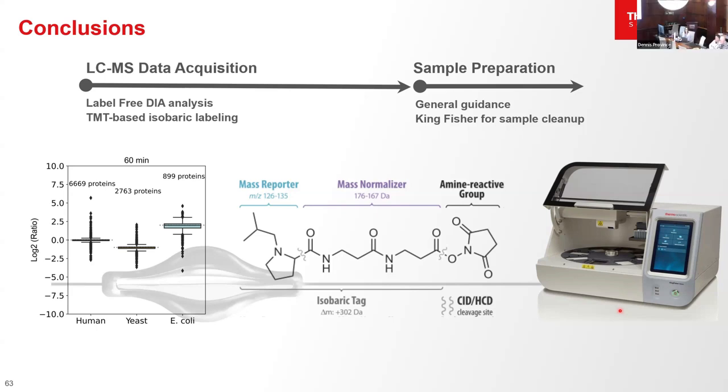That's good. So once we do biomarker discovery and find a biomarker, are we able to validate those with a regular assay, like ELISA, antibody-based? Yeah, so once you identify a biomarker, right, you want to validate them. There are different approaches. You can use antibody-based approaches, or you can do an even deeper validation with mass spec. So you can do absolute quantitation.